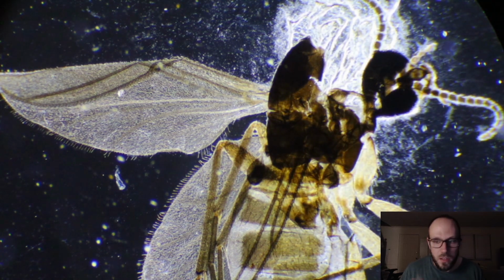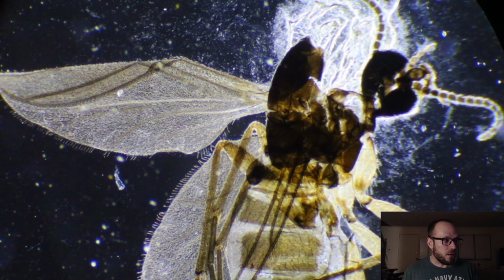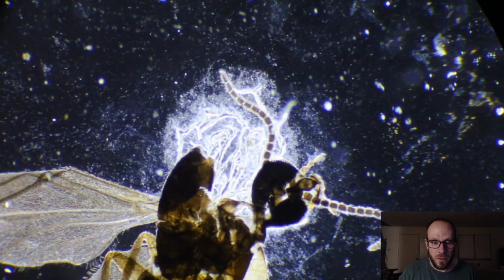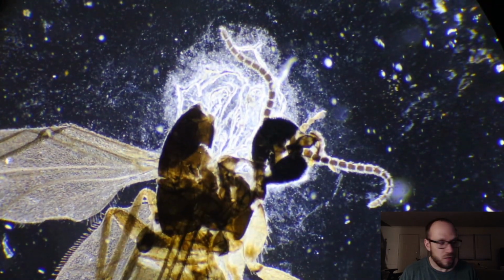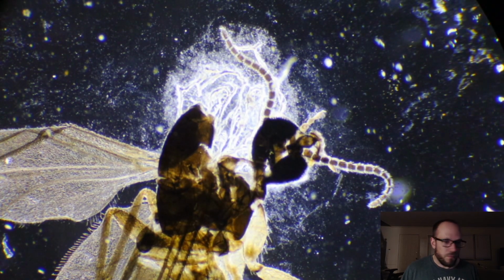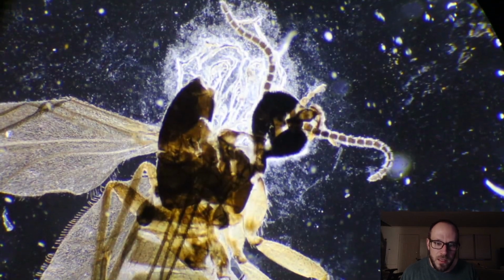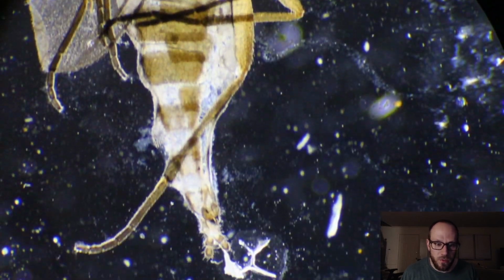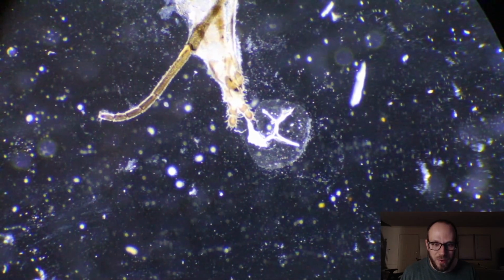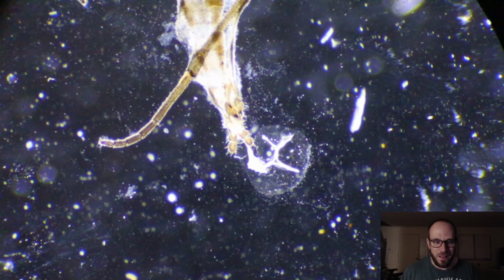Alright, cool. So, Darkfield obviously gives you a much different view. All the guts that were spilling out of his head now look much more visible because they're being illuminated from the sides rather than from below. And his eyes, we're not really able to see them too well through the camera. And this is what I was talking about, that poop coming out of him, or whatever.